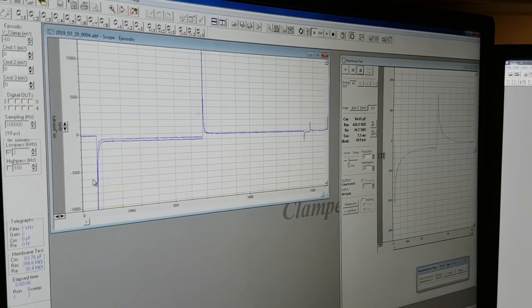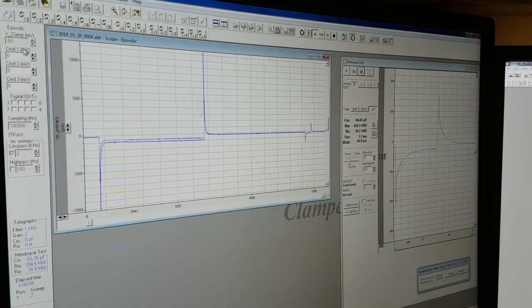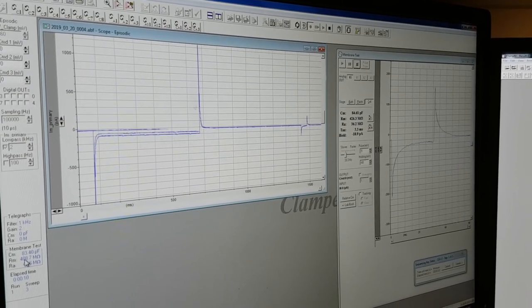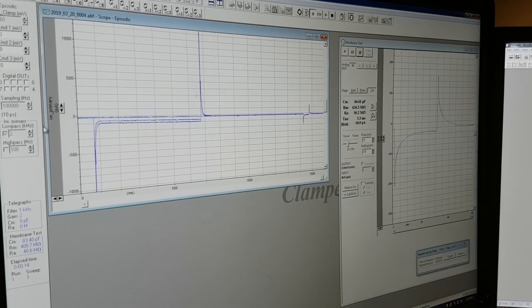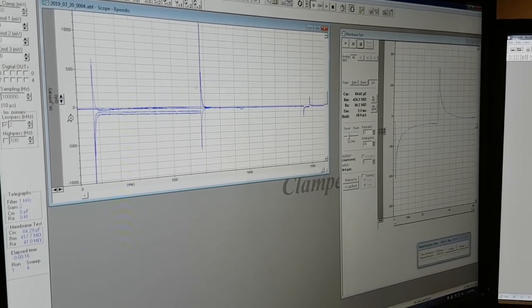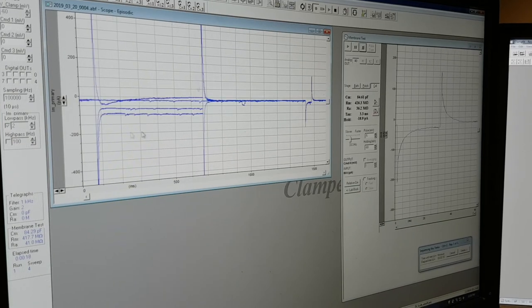Notice that as this IV curve is running, we'll start to see small, miniature excitatory postsynaptic currents occurring.